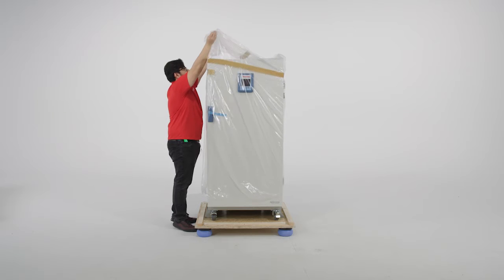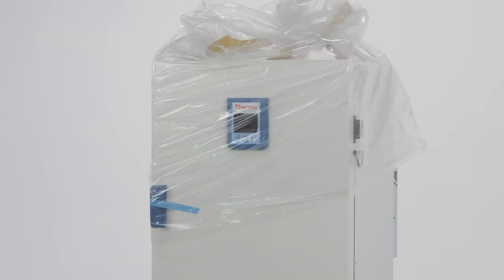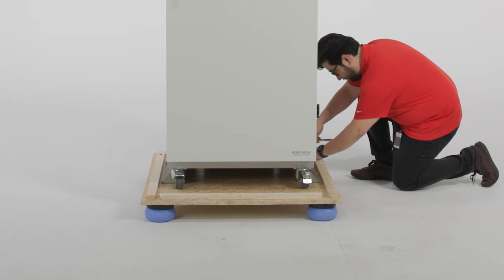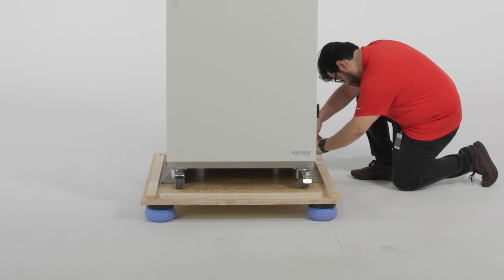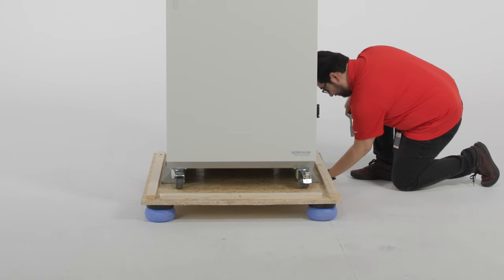Remove the plastic cover from the unit. We suggest retaining this cover for future use in case the unit needs to be moved or stored for a short period of time. The floor-standing IMP400 is held in place by two side brackets and wooden supports that will need to be removed before the unit can be taken off the pallet.